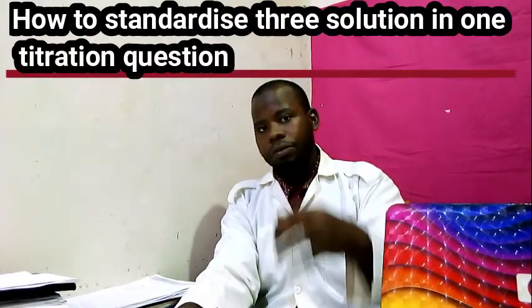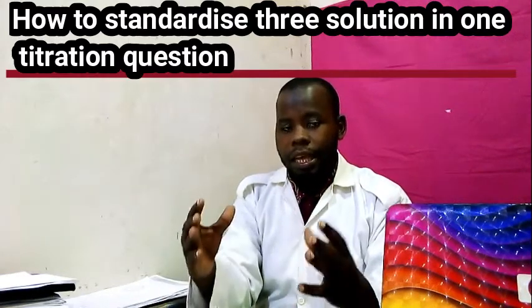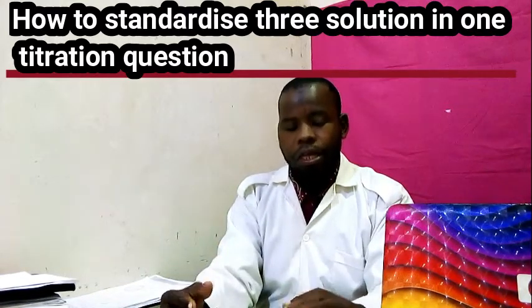ammonium ferrous sulfate either by diluting or by adding concentration. At the end you reach the accurate volume according to the molarities or molar ratio of that reaction or that reactant. So the point is, when you meet the solution which is used in both procedure 1 and procedure 2, that solution, don't disturb. After preparation, just put it aside, and then you adjust the other solutions which are not used in both.